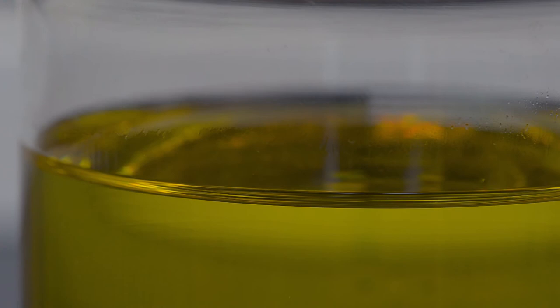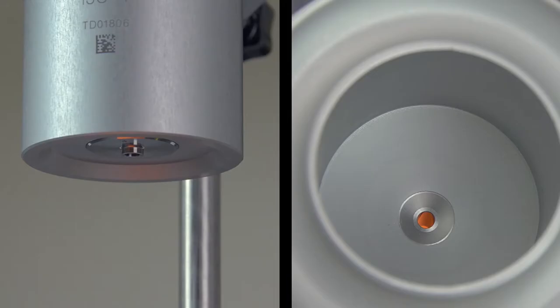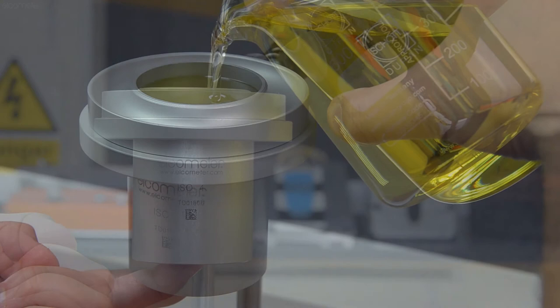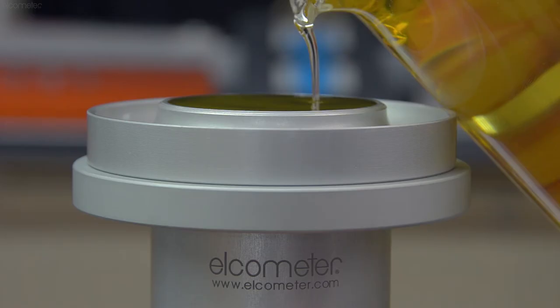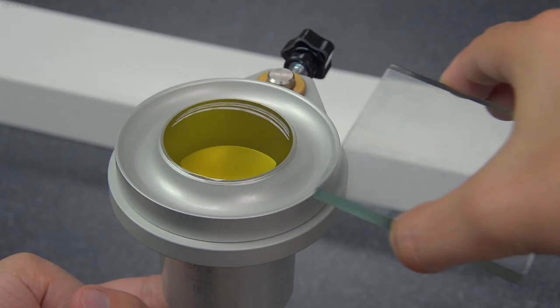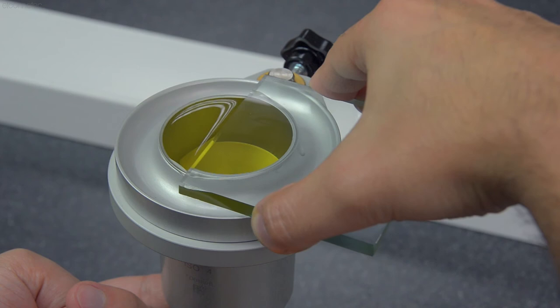Before pouring your sample liquid into the cup, ensure it's free of air bubbles. Ideally, you should use a freshly strained sample. Place a finger under the cup orifice to close it, and gently pour the liquid into the cup, avoiding the formation of any air bubbles. You should slightly overfill the cup, then slide the glass plate over the rim of the cup to push the excess sample into the overflow channel, ensuring your cup is completely full.